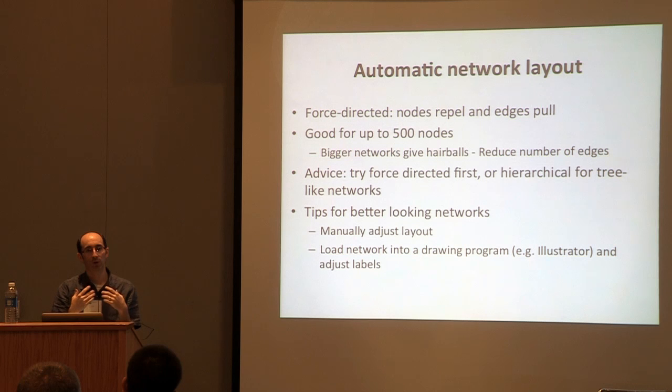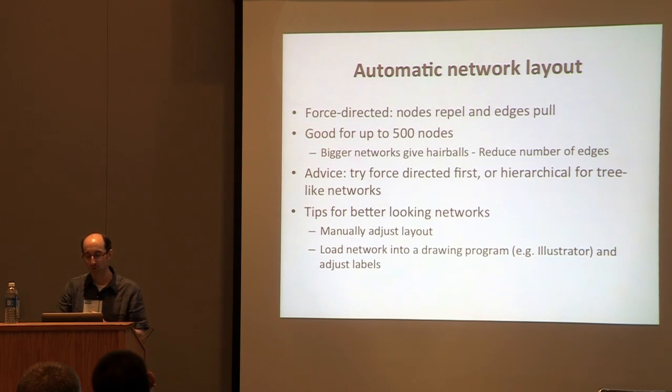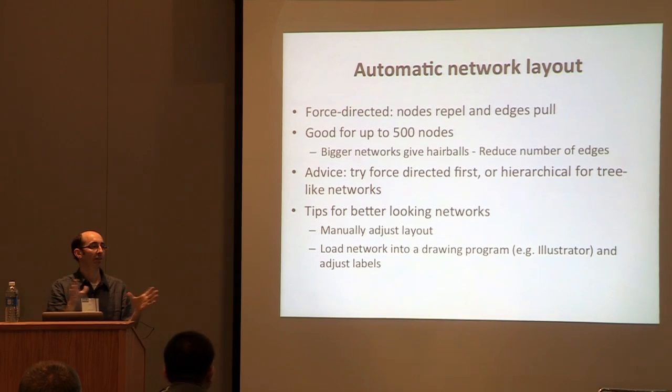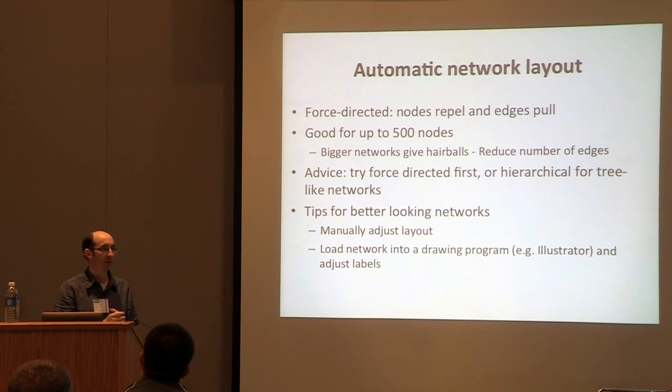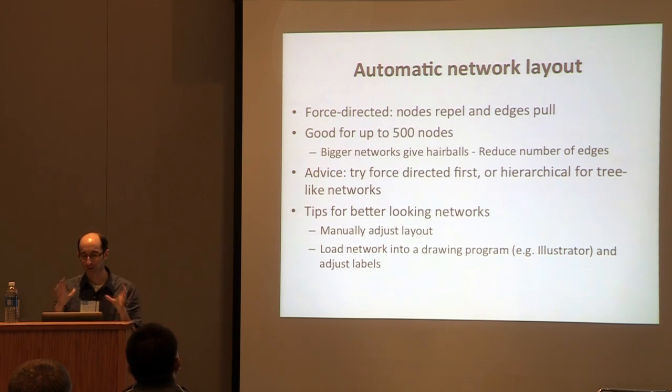And then you can also export, often from most network visualization tools. You can save the network as a PDF and load it into Adobe Illustrator or some other vector graphic drawing program, and adjust the labels and emphasize certain things and highlight certain things, and that usually makes for a better network when you're ready to have a publication quality figure.